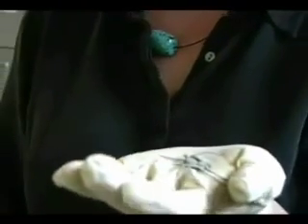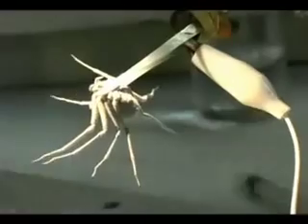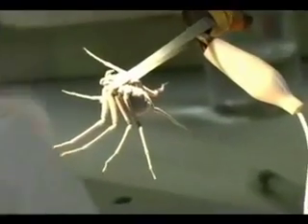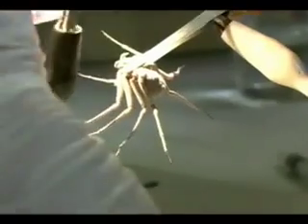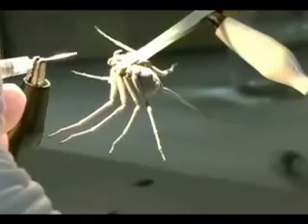The spider's sleeping — I've put it to sleep with carbon dioxide — and now I'm going to show you how I collect venom from it. I'm going to rinse her fangs, try to get some of the sand off. This thing in my left hand is a little vacuum that I've created that I'll put on the spider's mouth.